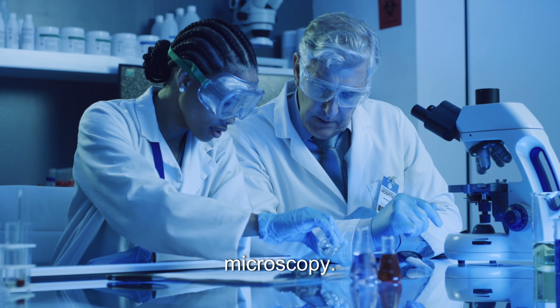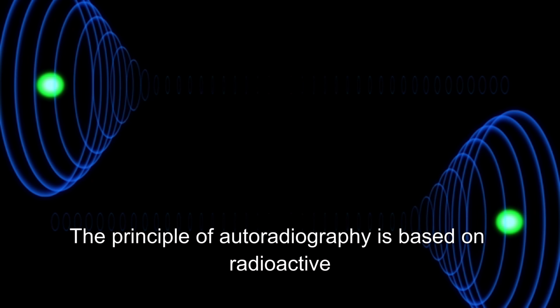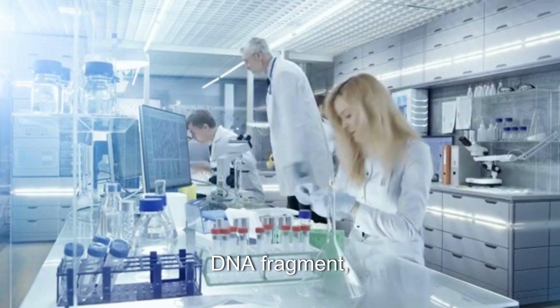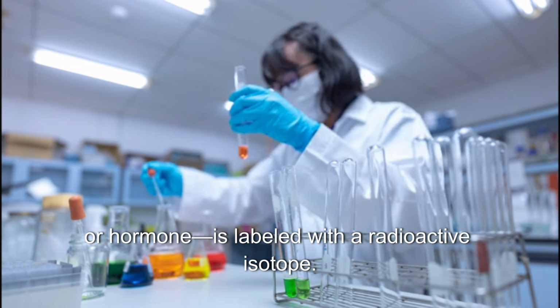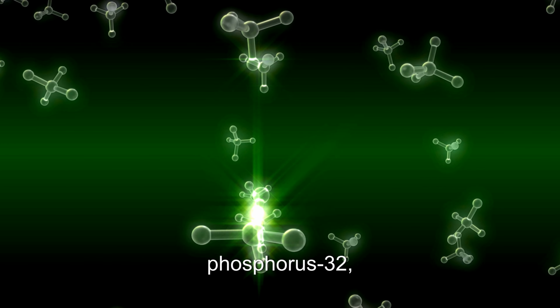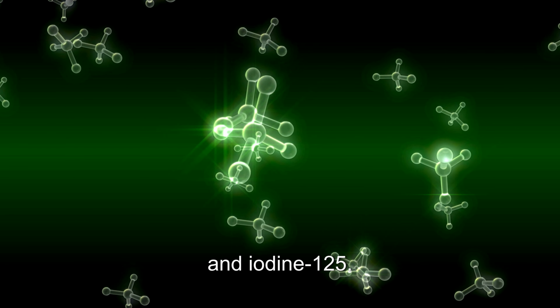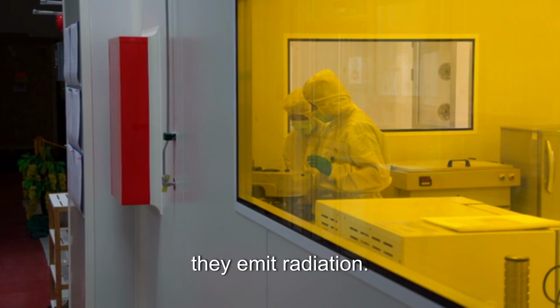using conventional microscopy. The principle of autoradiography is based on radioactive decay. A molecule of interest, such as a drug, DNA fragment, amino acid, or hormone, is labeled with a radioactive isotope. Commonly used isotopes include tritium, carbon-14, phosphorus-32, sulfur-35, and iodine-125. As these isotopes decay, they emit radiation.